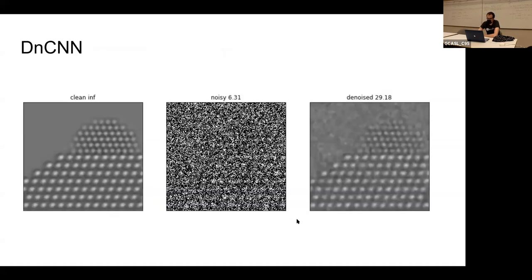Okay. So these are the results. The results are actually quite impressive when you compare them to what wavelet denoising or Wiener filters do. In particular, it is better than wavelet denoising, right, Shreya? Right, yeah. In terms of PSNR, it's about 5 or 6 points better.